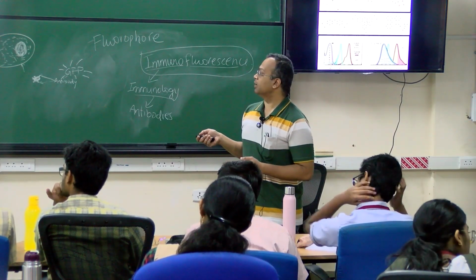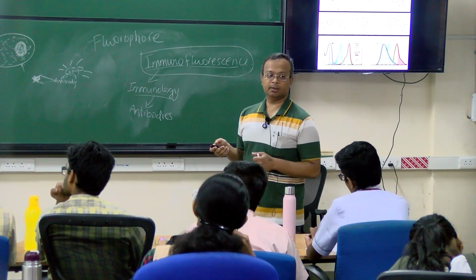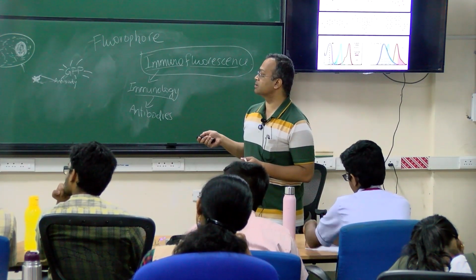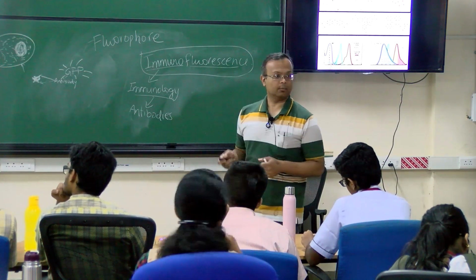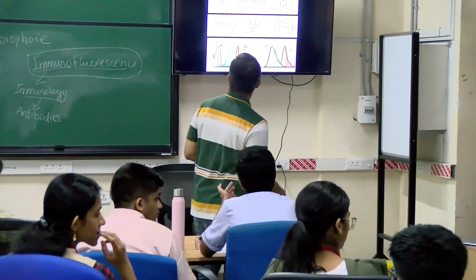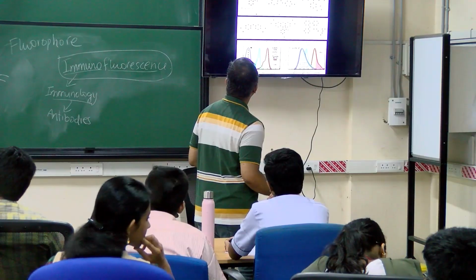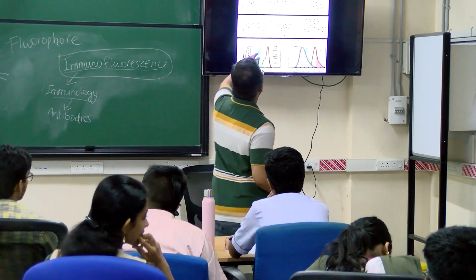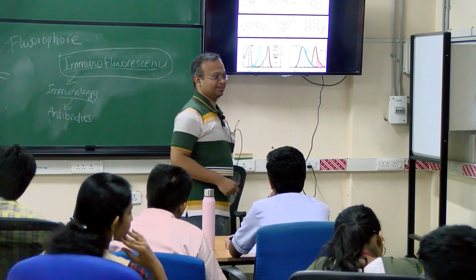But if you shine green light or red light on DAPI, it will not get excited. It will get excited only in this range, around 360 nanometers. Here propidium iodide has blue, red and yellow fluorophores. No, that is just the different atoms. That is not the color.